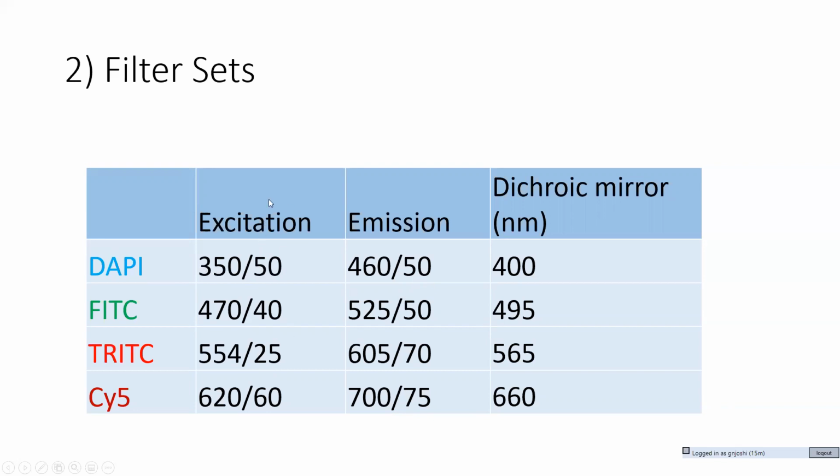So while we are saying that, let's say, for example, FITC might have an optimum excitation of 488, but when we are in fact exciting, we are going from 450 to 490. Okay, so that's the entire region that we are exciting.